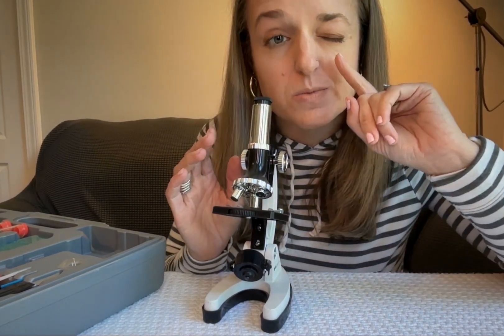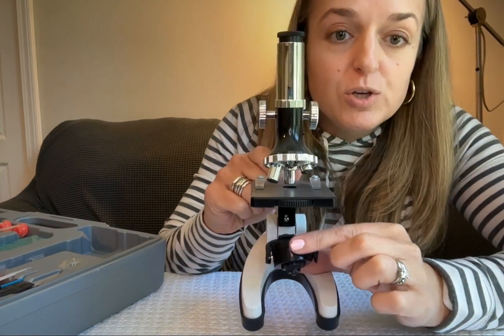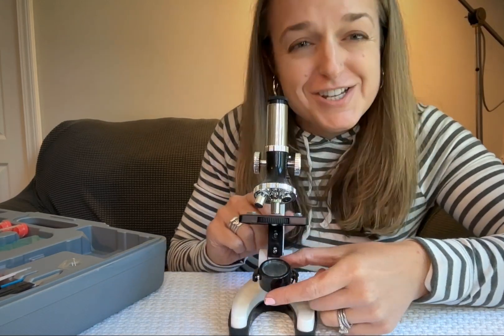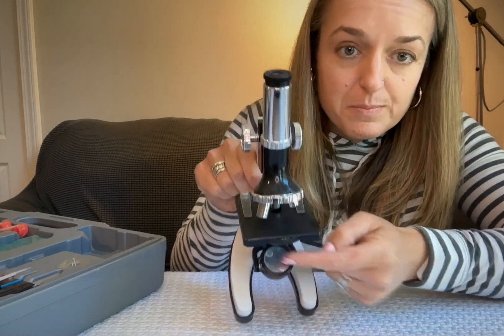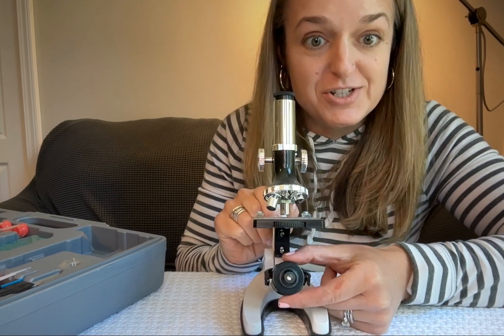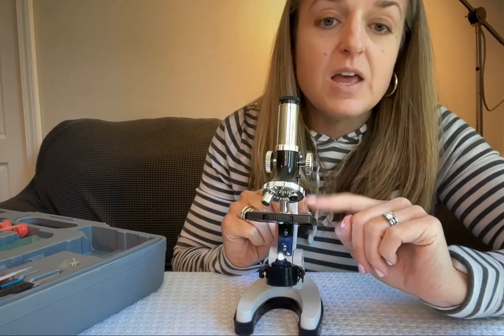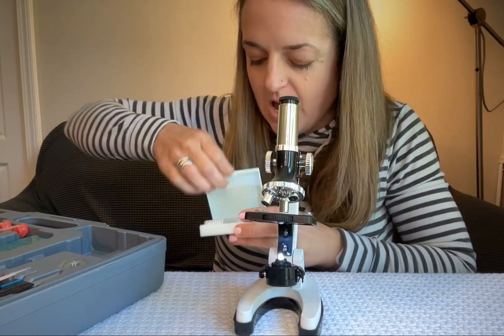This is a standard type where you look down through the eyepiece — remember, the trick to looking through a microscope is to close one eye and look through with your open eye. You can collect light with this mirror by pointing it at a light source and getting it in just the right position so it shines light up through the plate, or you can flip it around — did you see that? Just the motion of flipping it around automatically turns on the light, and then you can point it toward the plate to see.